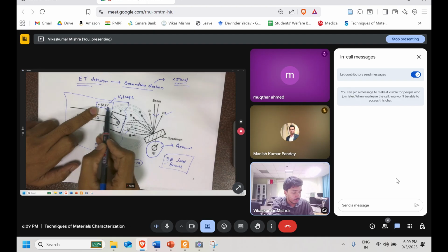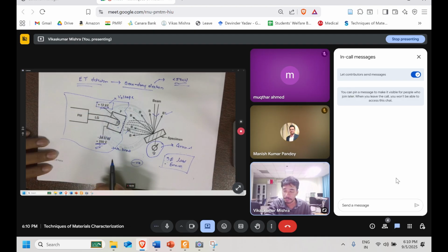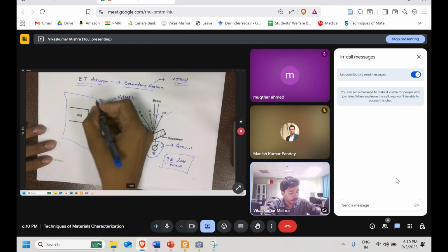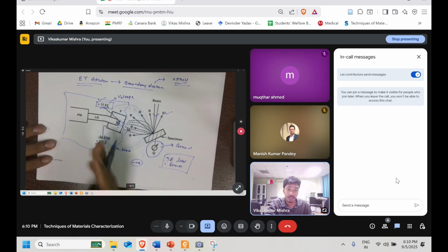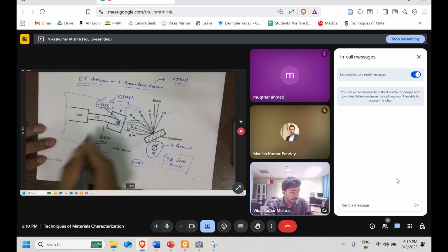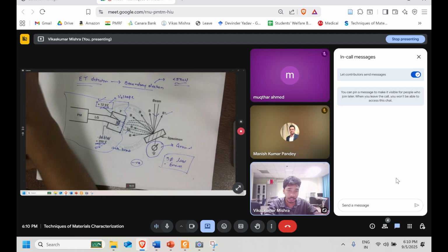Now, with this much high voltage applied, the electrons which have entered this cage will be accelerated toward the scintillator. Now the phenomenon of phosphorescence will happen, and the detector will absorb those electrons. The material will undergo high excitation.